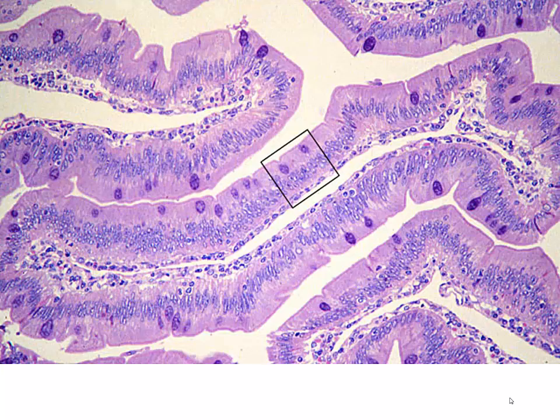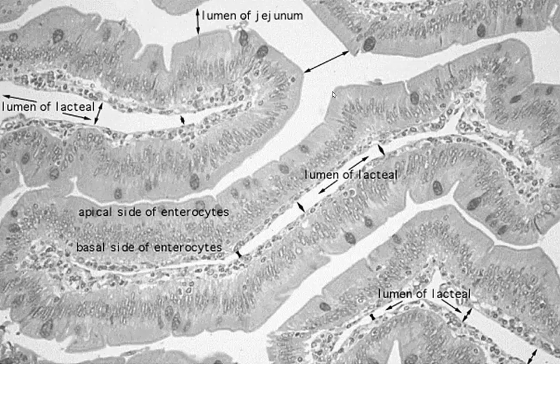We continue to look at the mucosa that's lining our intestinal epithelium, and what we're seeing here stained in purple, these are going to be our goblet cells. A little bit different stain than we're used to seeing, but we can see our simple columnar epithelium. You can even see the brush border on these, even at this low mag, but the number of goblet cells that we're going to see, and this is going to be ever increasing as we continue to get further and further down through the alimentary canal.